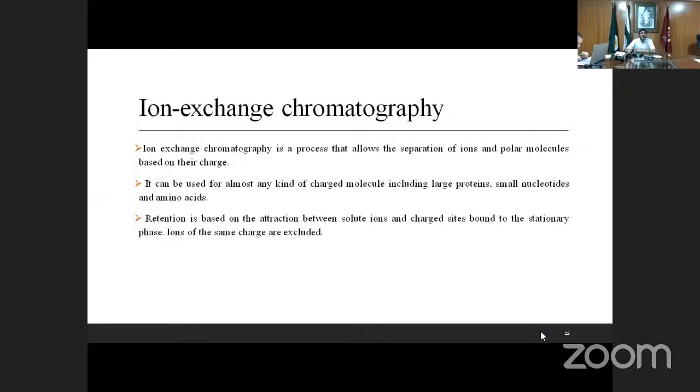Another question, from Raji Golaji: please explain why we are changing the concentration of the mobile phase. This is the same question which I already answered: for better understanding, better resolution, and to get a better peak. This question and the previous question are the same.